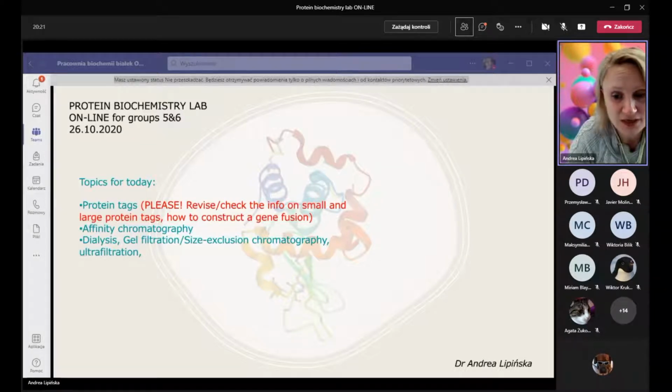So these are pGEX series plasmids, and what you can see is that in most of them, between GST, the GST protein, which should be on the left, and your protein of interest, which should be on the right, so there is N-terminally used GST, and our protein is at the C-terminus of the fusion. There are recognition sequences for proteases, like thrombin, like factor Xa, so this is the clotting factor from our blood.